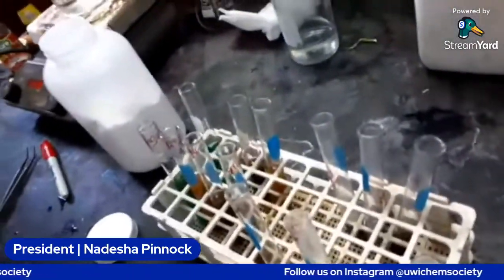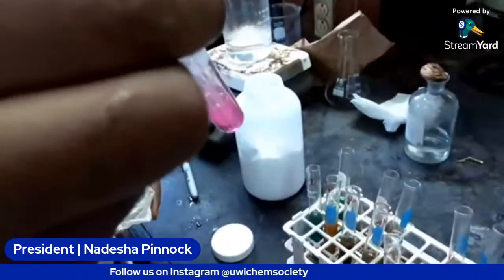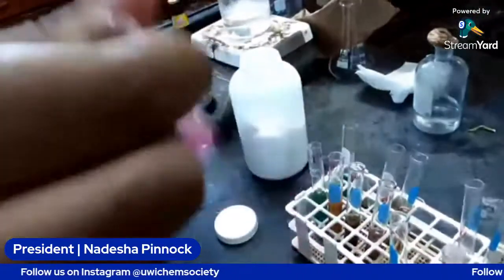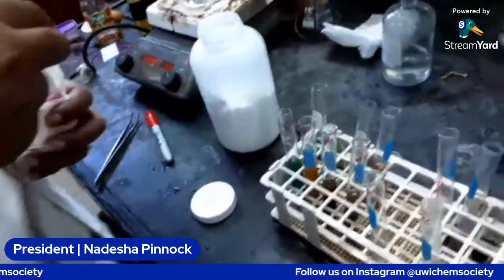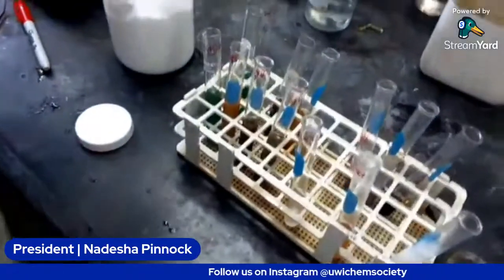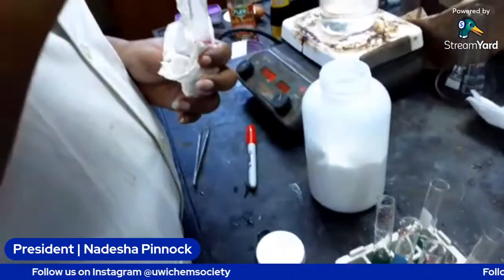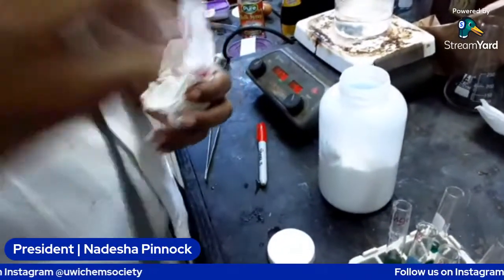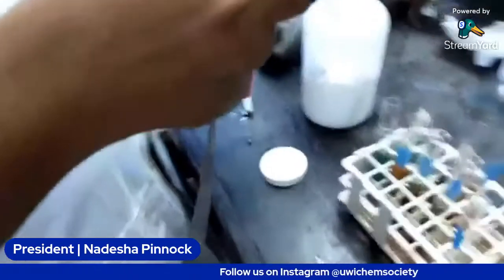That one is a syrup. Still fizzing. Like no one is done fizzing today.